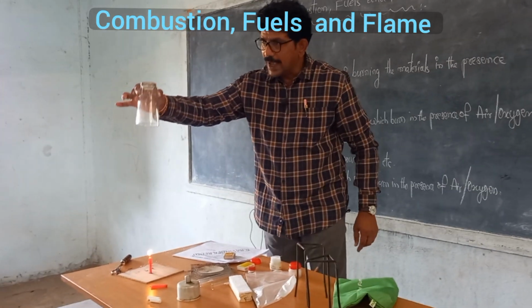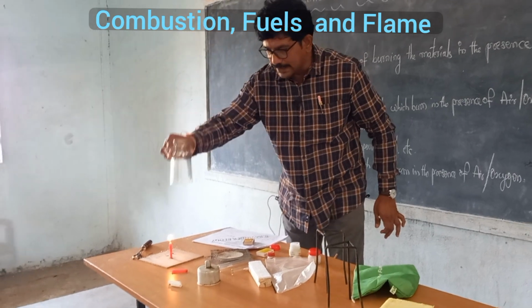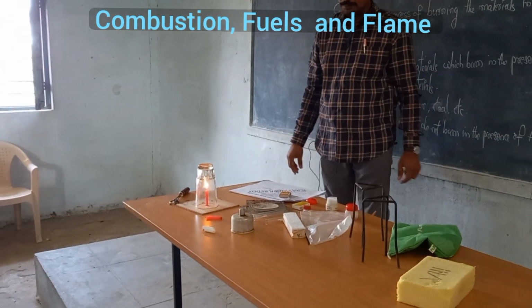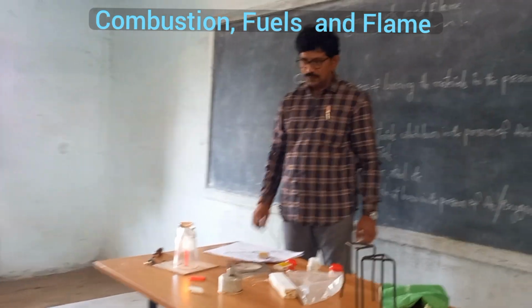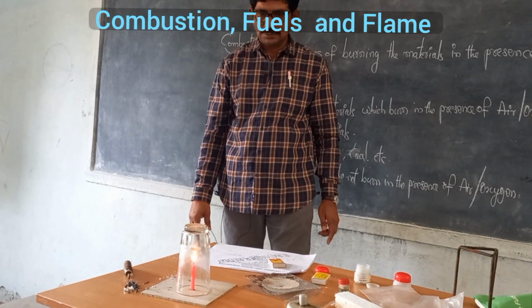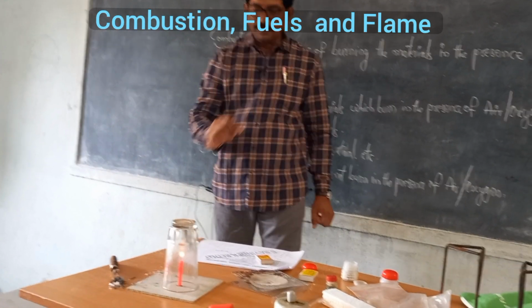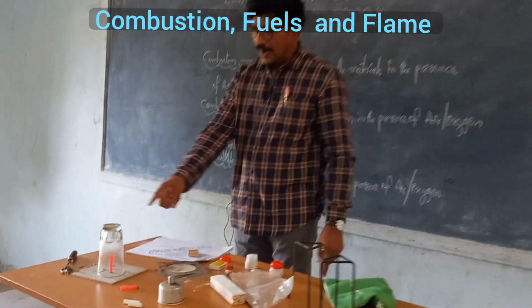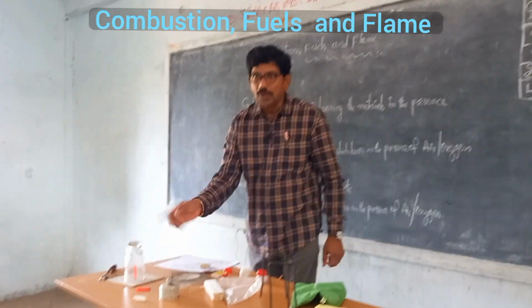Now what am I doing? I am inverting the glass on the candle. Observe what happens to the candle. Observe this. What happens? Observe it carefully. What happened to the flame? The flame is put off.